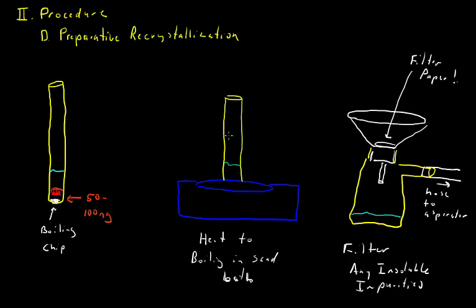And again, as we mentioned previously, if you don't get crystal formation as this is cooling, and you're fairly certain that your solution was saturated, the first thing to try here is scratching the inside of this with, I usually use, the stem of a glass Pasteur pipette. That leads to little tiny scratches in the glass that are nucleation spots for crystal formation to begin, and often you'll see crystals forming rapidly when that happens. If that doesn't happen, you can try cooling it in an ice bath. That further reduces the solubility and can tend to lead to crystal formation. And if that still doesn't work and you're certain that your solvent worked well, following the procedure above for finding a good solvent for recrystallization, you probably have to boil even more of the solvent off to get crystallization to occur. It's still not saturated.